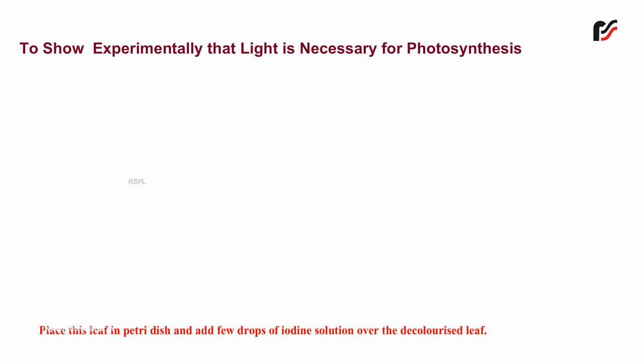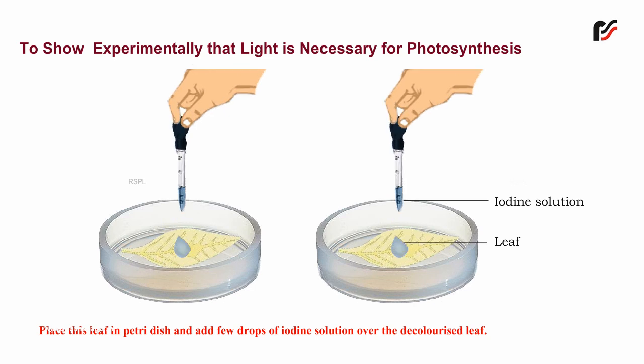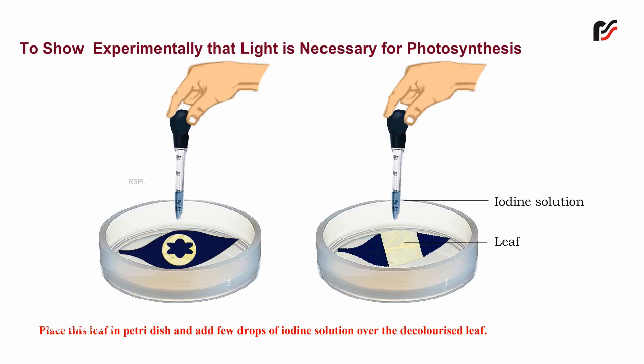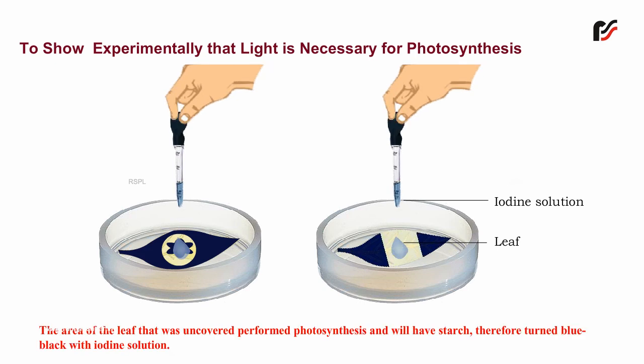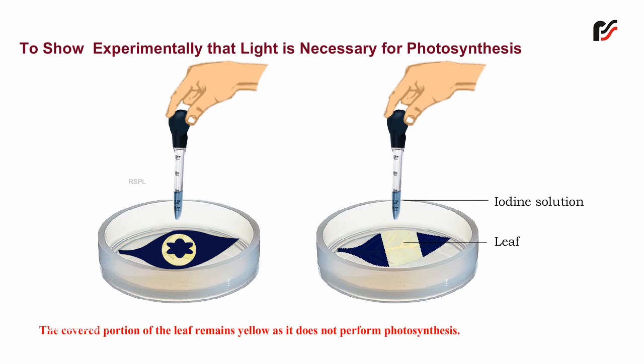Place this leaf in a petri dish and add a few drops of iodine solution over the decolorized leaf. The area of the leaf that was uncovered performed photosynthesis and will have starch, therefore turning blue-black with iodine solution. The covered portion of the leaf remains yellow as it does not perform photosynthesis.